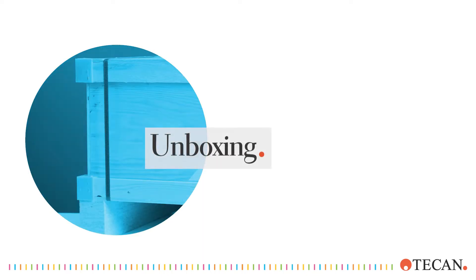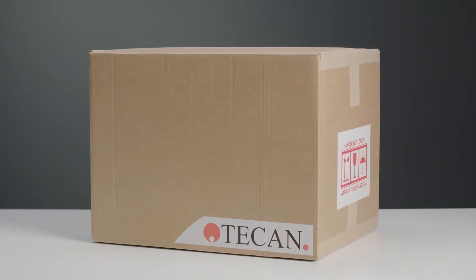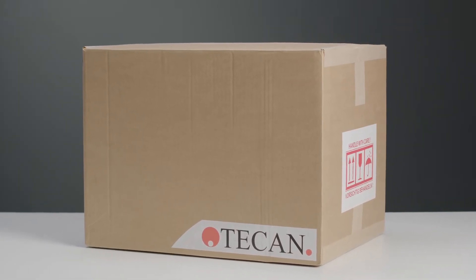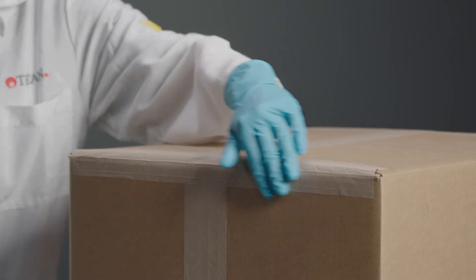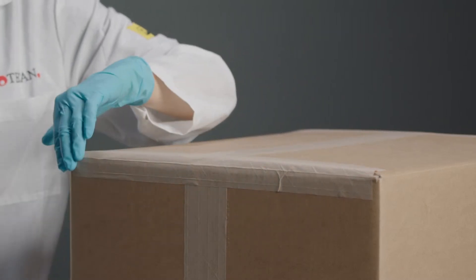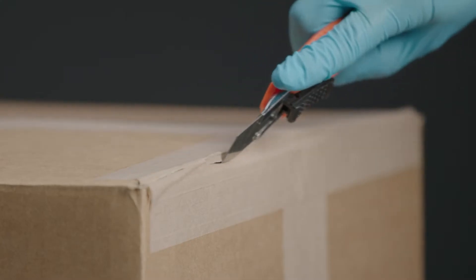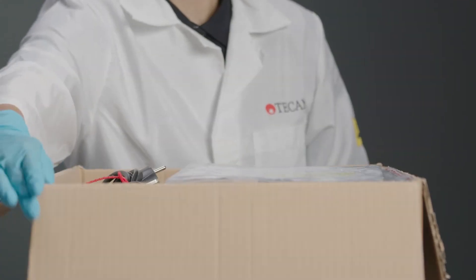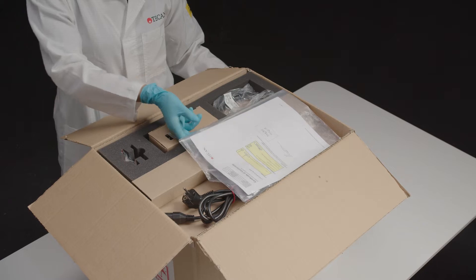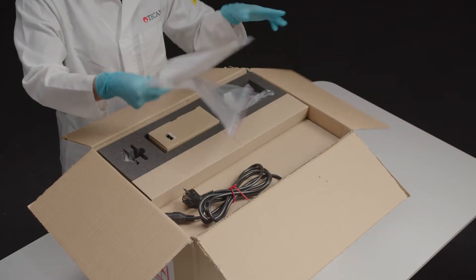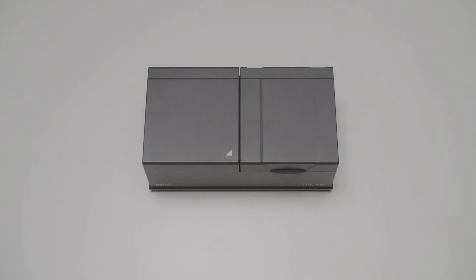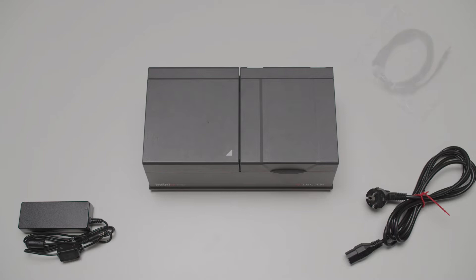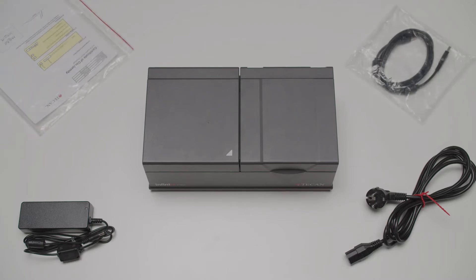The Infinity F50 comes in a box like this one. Make sure you check for any damage when it arrives. Carefully remove the F50 from its packaging. The package also includes a power cable with a power brick, a USB cable and various relevant product documents.